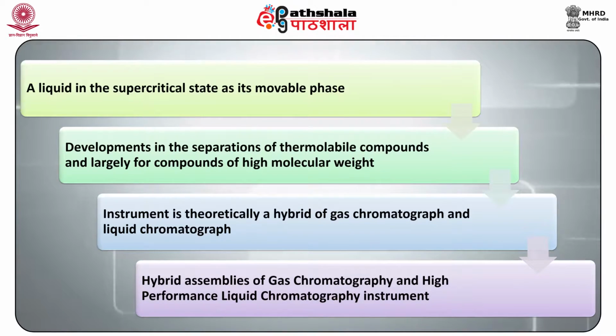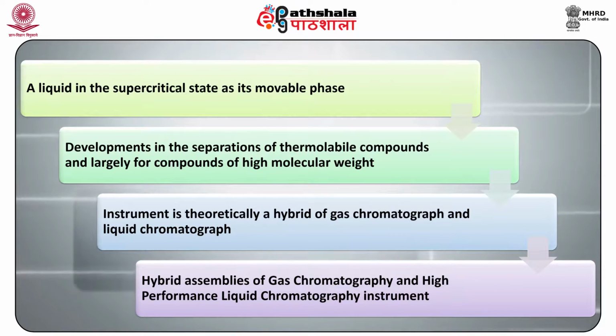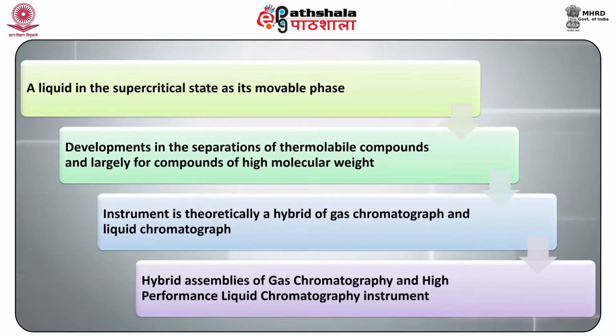SFC, as it is abbreviated, works as its name proposes, with a fluid in the supercritical state as its mobile phase. This leads to developments in the separation of thermolabile compounds and largely of compounds of high molecular weight. The instrument is theoretically a hybrid of a gas chromatograph and a liquid chromatograph. The instrumentation for supercritical fluid chromatography represents hybrid assemblies of gas chromatography and HPLC instruments, that is, high performance liquid chromatography instruments.